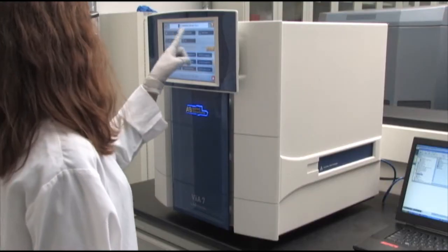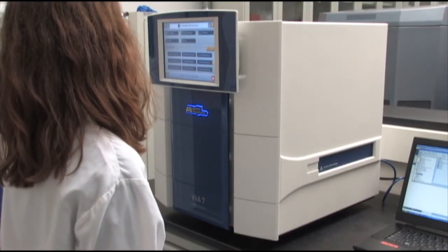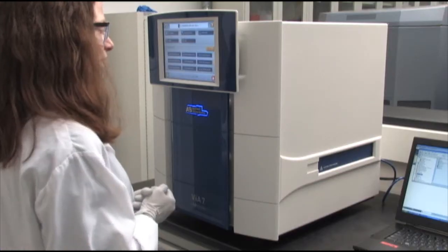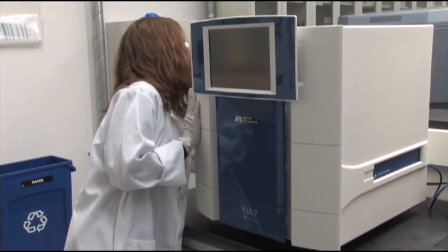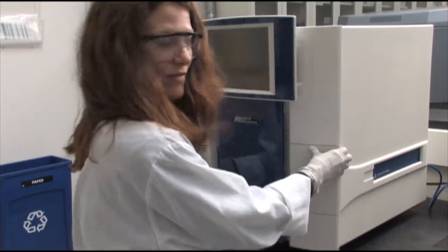We're ready to load the TaqMan Array card. First, I see that the 384-well block is installed in the instrument, and I'm going to want to change it out for the TaqMan Array card block. So what I will do is turn off the instrument at the back and then open the front of the instrument.